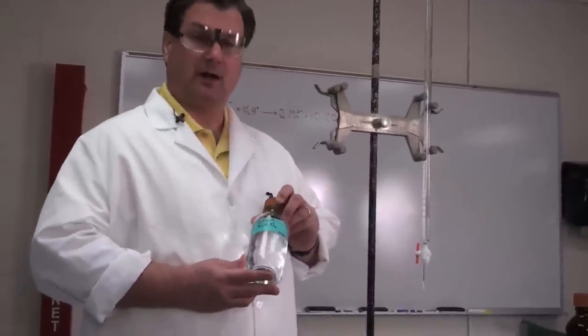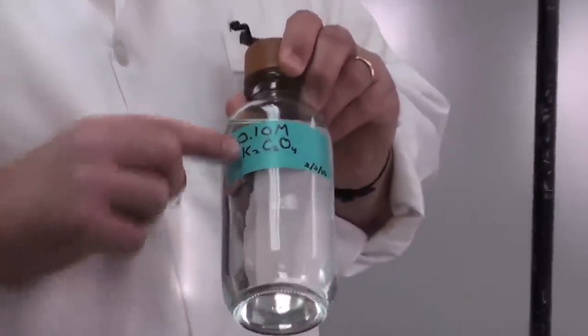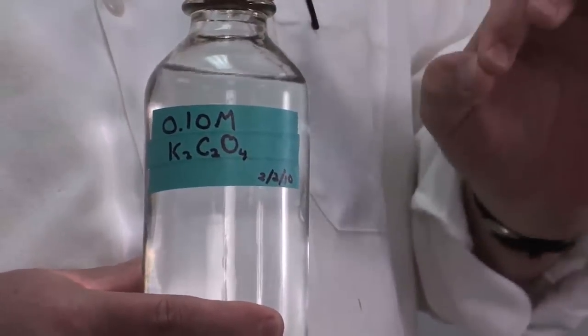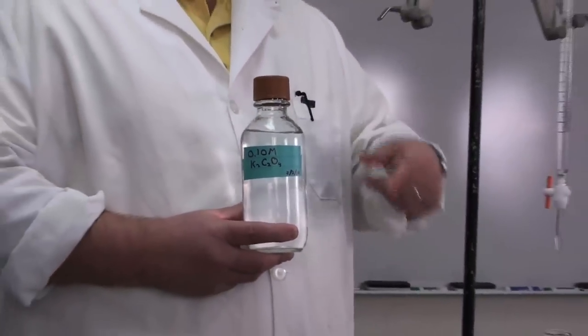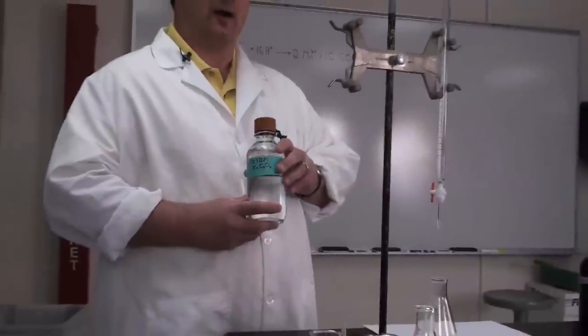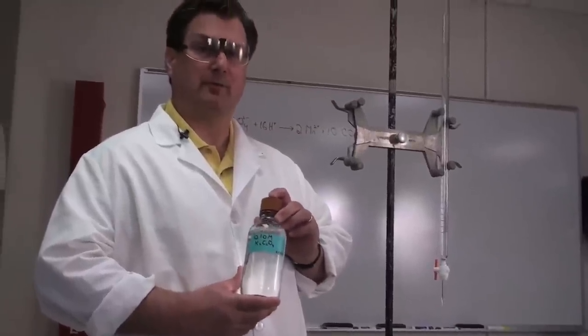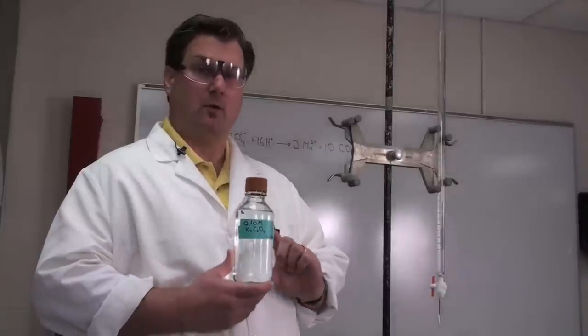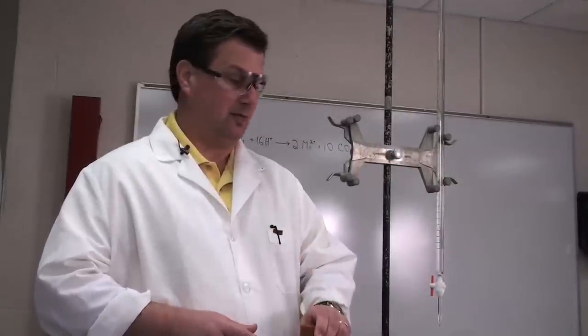Our standard solution, potassium oxalate, I've made to a known concentration of 0.10 molar gravimetrically. I've weighed out very precisely a known amount of material and dissolved it to a certain volume in water. Now we want to measure out a volume very precisely so we can determine the total number of moles used.